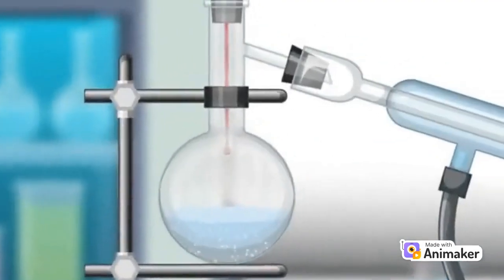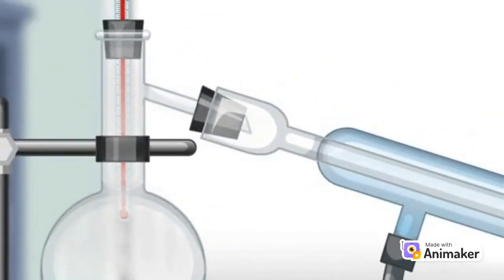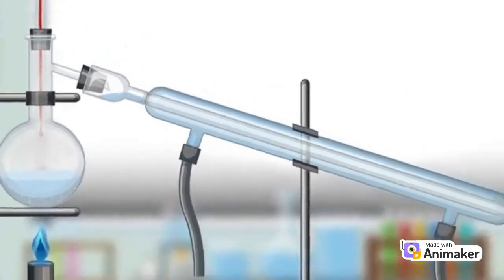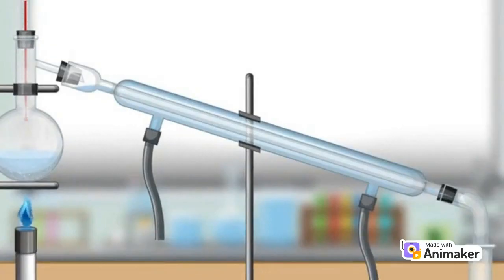Step 5. The vapor enters the condenser. The condenser is kept cool by the circulating water. The vapor is cooled and condensed back into liquid.